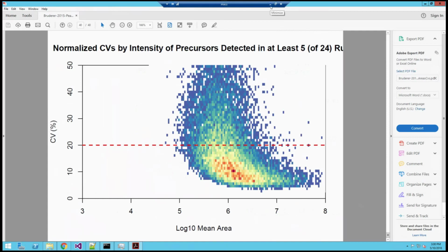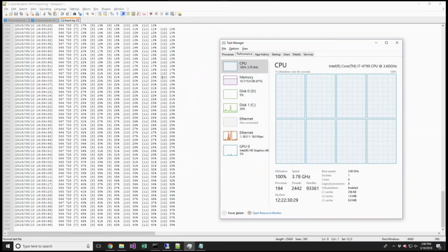Okay, so that's all PDFs generated by R. That script is really nice. This one's still working and will be for probably another while, but that one processed everything in about 15 minutes. This will process everything in about 45 minutes.